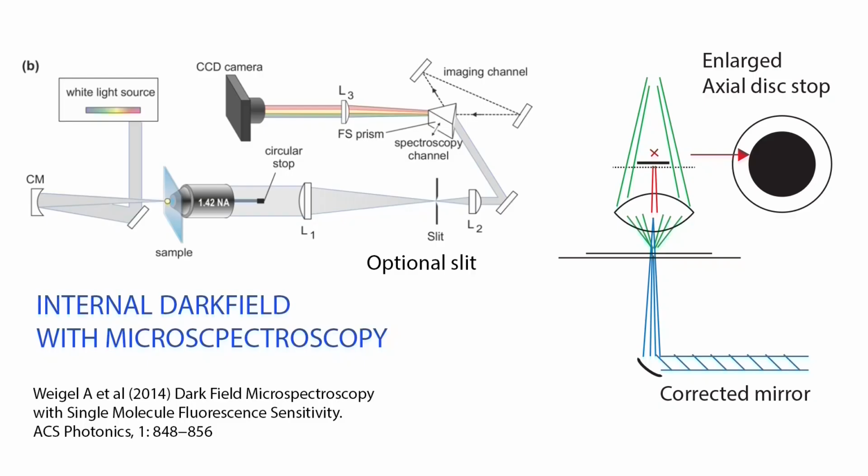Only a very low-intensity image is captured, suitable for detecting gold nanoparticles or single fluorescent molecules. However, the method achieved an extremely high signal-to-noise ratio.